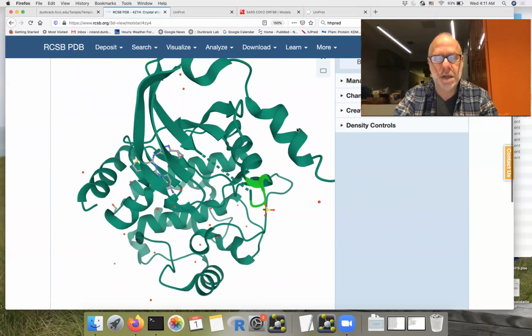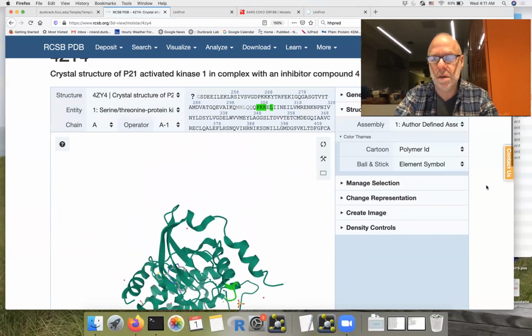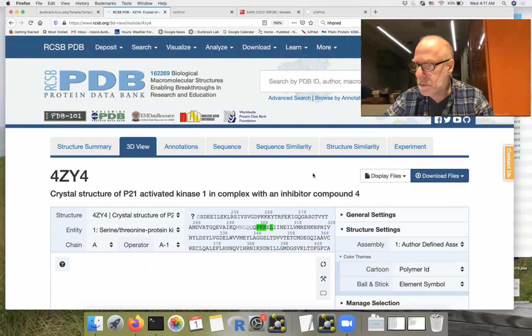And that's nice, because otherwise it's sort of hard to navigate between the sequence and the structure. And in the older viewer NGL, you don't have that option. Okay, I think we went through everything on my list. This is the beginning of that HTML page I showed you.